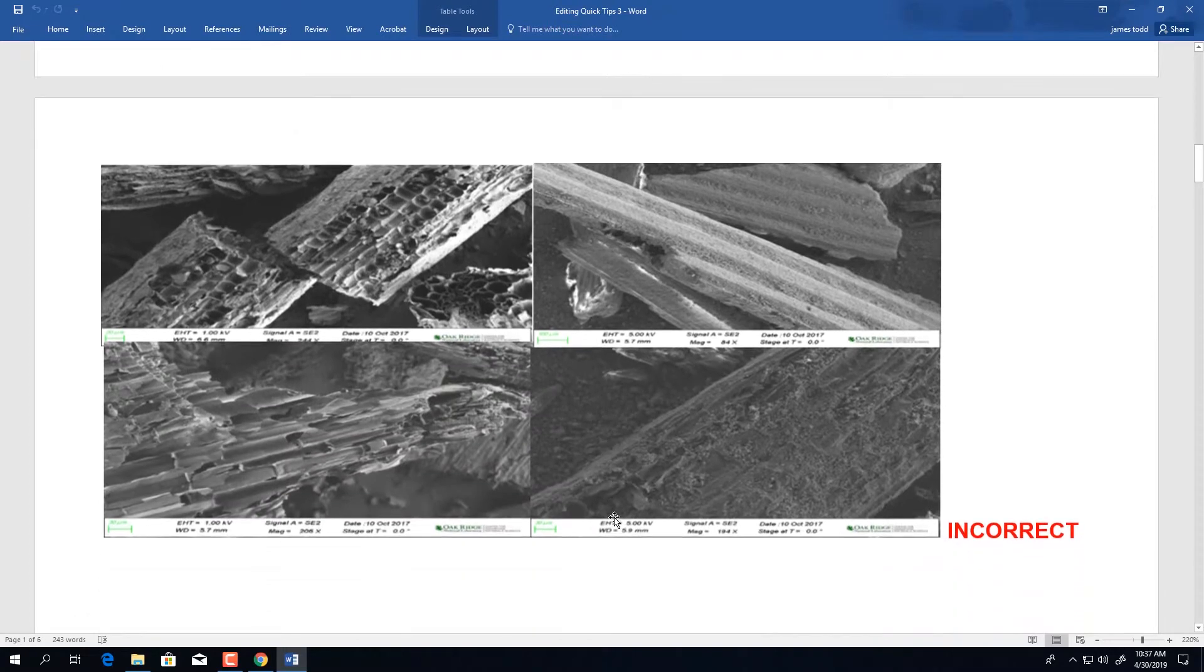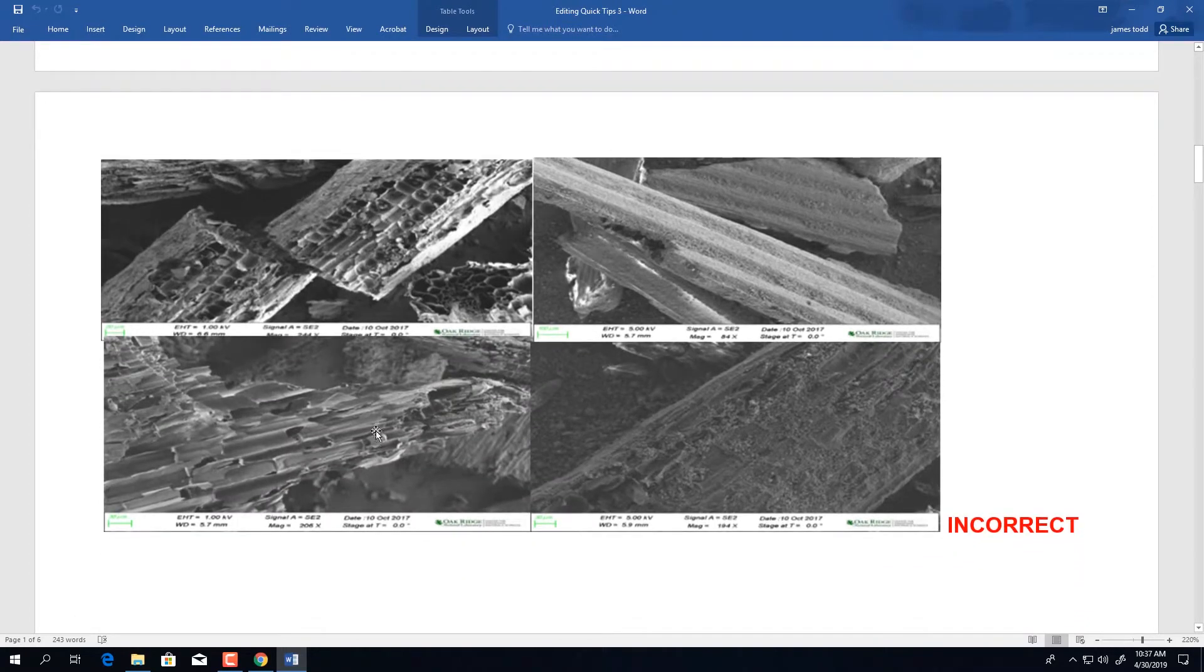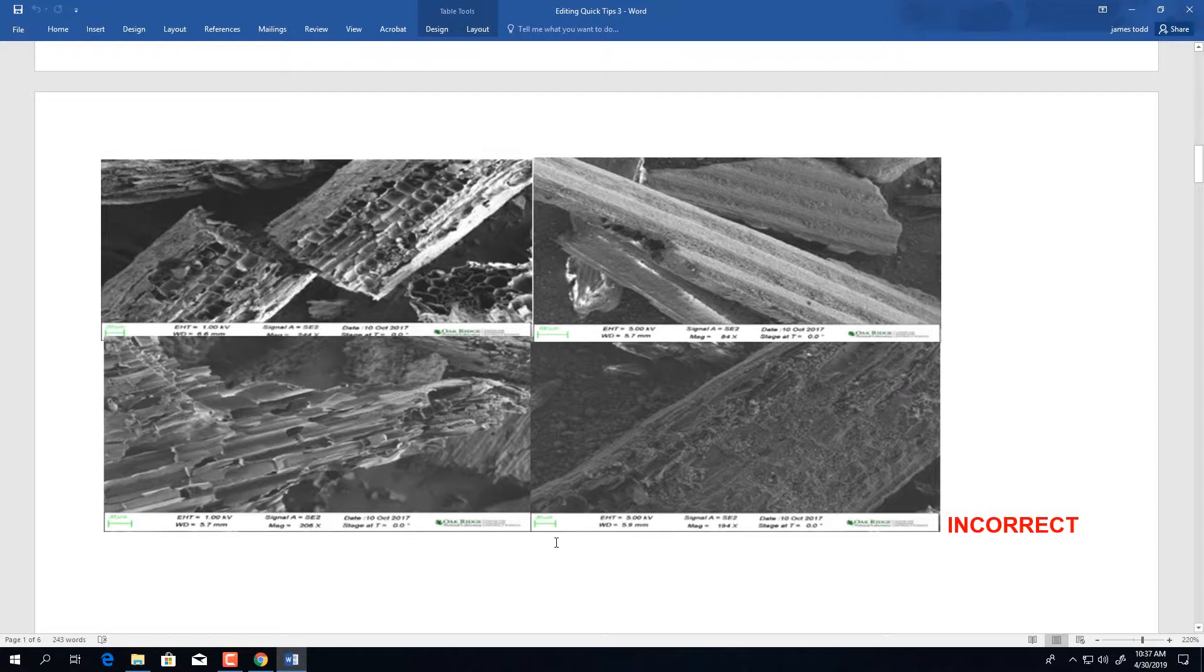As we continue, this is another example of a set of images that were submitted. The bottom bar of information is microscope generated and can be omitted, as well as there are missing panel letters and a scale bar that needs to be incorporated.